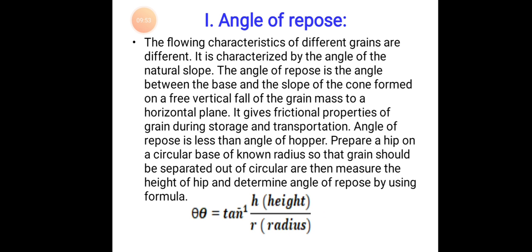Prepare a heap on a circular base of known radius so that grain should not spill out of the circular base. Then measure the height of the heap and determine the angle of repose by using the formula tan inverse of h by r, that is height by radius.